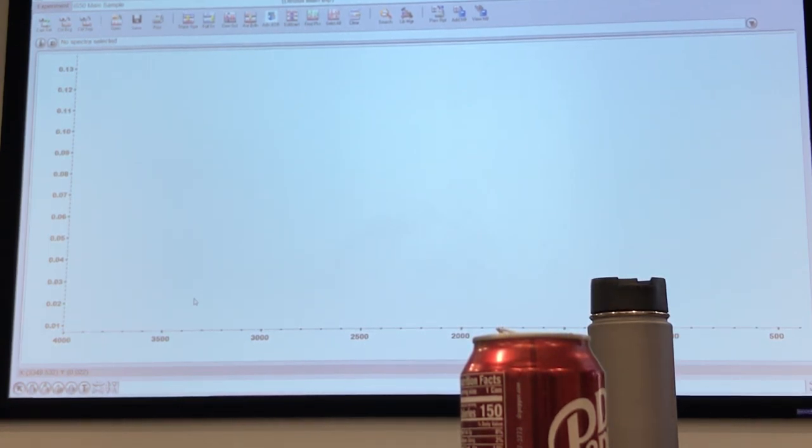That's why I always say, if you're characterizing them individually, you have more power to do more in-depth analysis. But if you are doing automation, you will have to extract those spectra out where you are seeing, okay, this is giving me a 70 match score. So let me extract that spectra out from the big group of data and then run them individually, meaning analyze or process them individually and look through. Yes, absolutely. But you can program a routine that does that on the back. Yes, that's where we are going next.